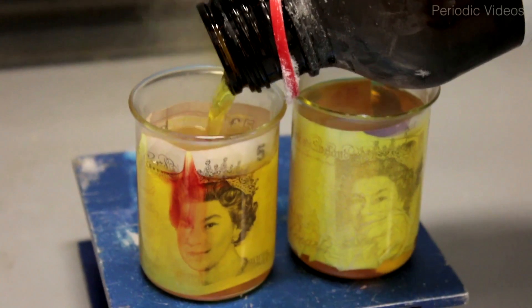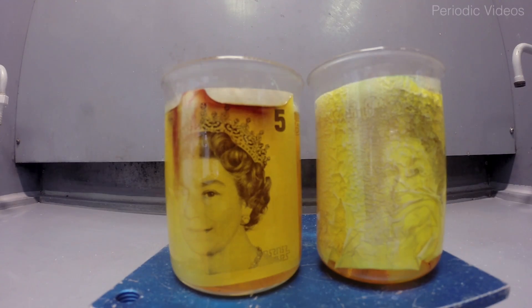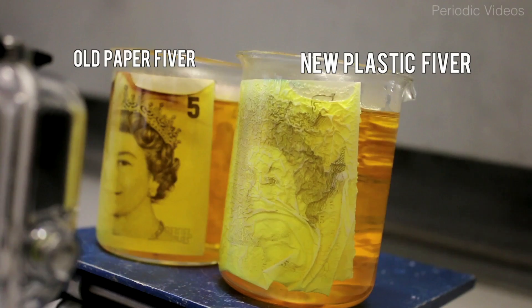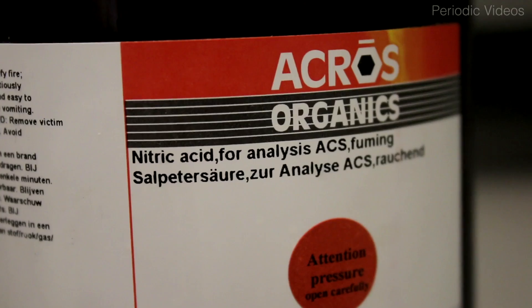Or perhaps I should say wizard's brew in the case of Neil. Fuming nitric acid is well known as a very powerful cleaning agent — if you can't get muck off your glassware, the last resort is fuming nitric acid. Neil's hypothesis was that he could completely dissolve the note; it would just disappear and he would have a solution of a five-pound note.